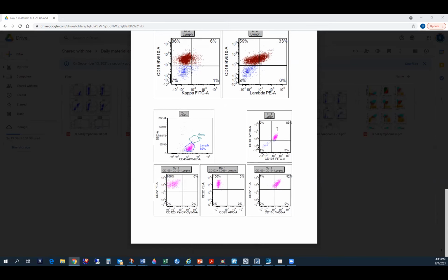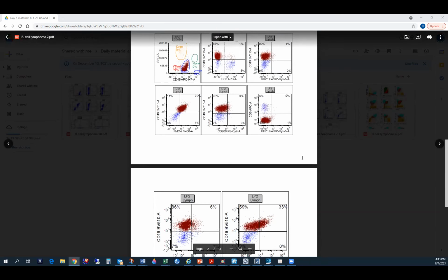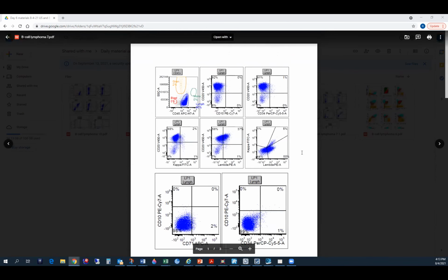It is kind of specific for hairy cell. So that helps. And they also say that sometimes 27 helps. I have heard that in lectures, but I've never used 27 in the B cell tube, so I don't know. Yeah, we don't use the 27 as well.